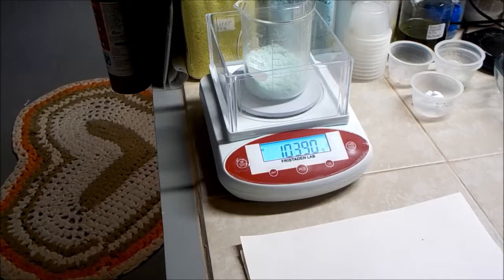This is the heptahydrate, so adding on the extra weight for the seven water molecules, I should have had a theoretical amount of 110 grams. So I know there's obviously going to be some losses through the filtering and the drying. So this seems quite reasonable. So I'll say this is good at this point, and I'll go on to the next step in making the Mohr salt.